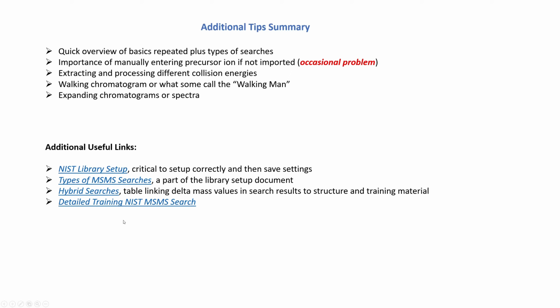And of course, if you want to learn more, there's a lot in the NIST MSMS search. I created a detailed training video series on how to do that. So let's go to the software now and look at some of these additional tips.